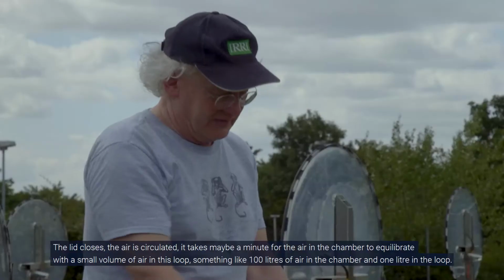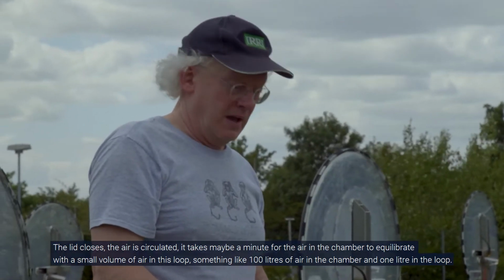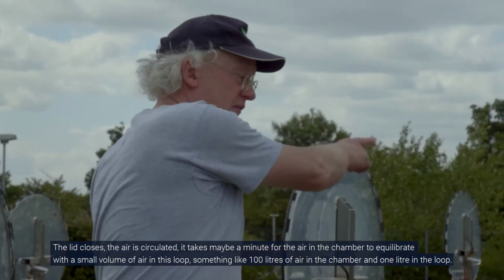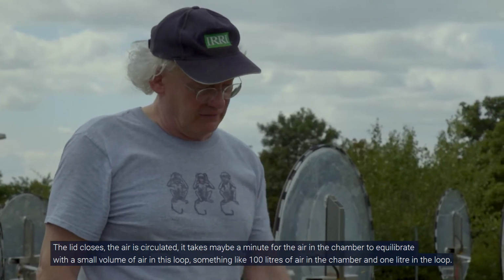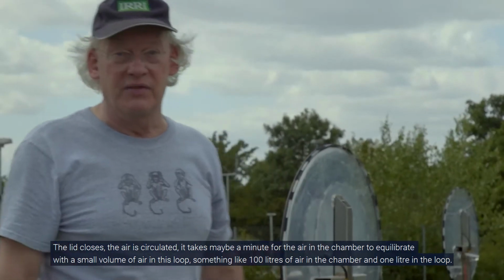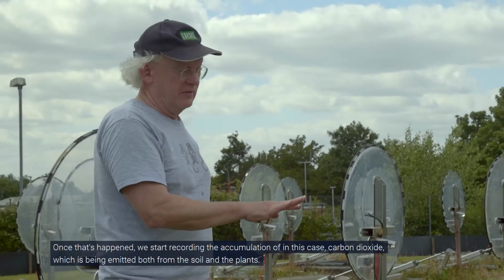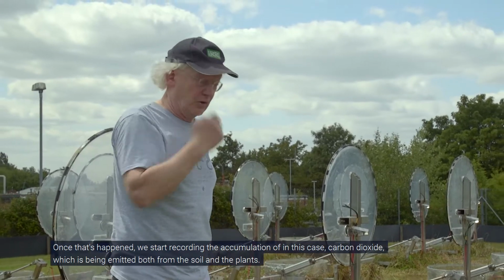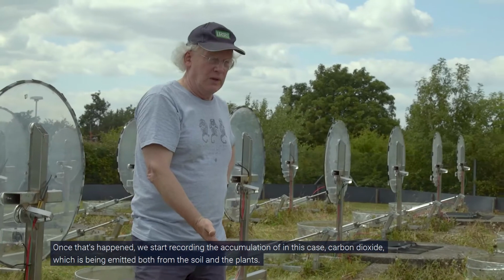The lid closes, the air is circulated. It takes maybe a minute for the air in the chamber to equilibrate with the small volume of air in this loop. There's something like 100 litres of air in the chamber and 1 litre in the loop. And once that's happened, we start recording the accumulation of, in this case, carbon dioxide, which is being emitted both from the soil and the plants.